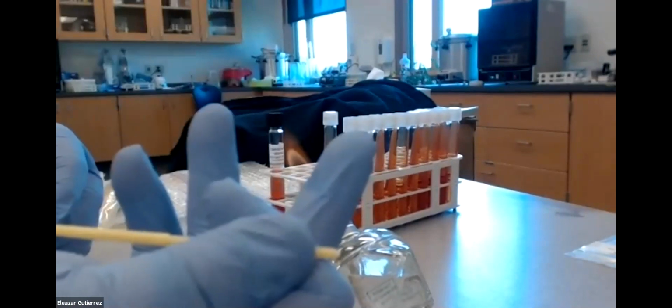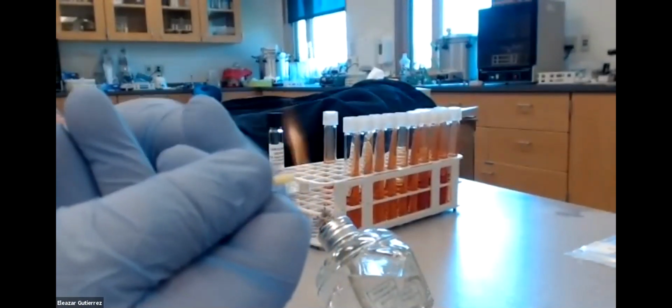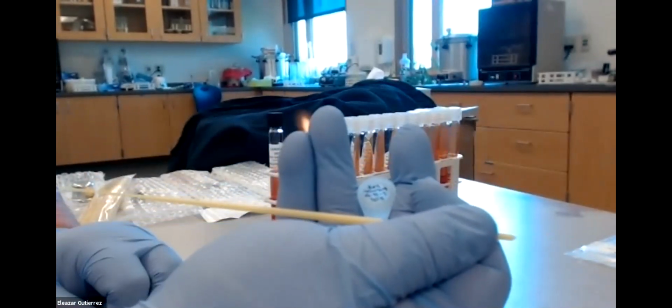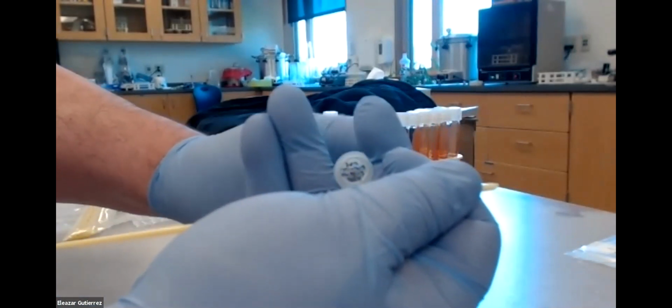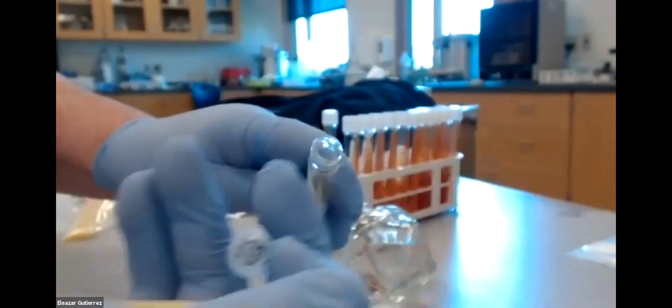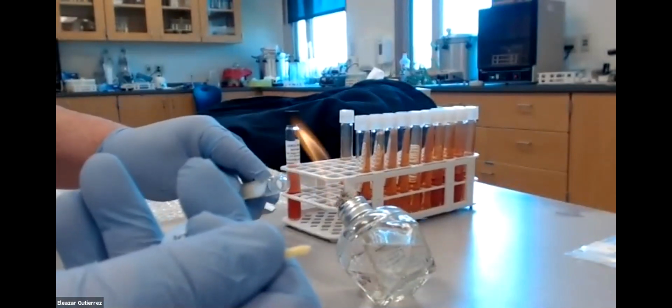So with the back of my hand, I'm going to grab the cap, just like so. You guys can't see that, can you? How about? There we go. Just like so. I'm going to push my lamp out of the way. Can you guys see that? Okay, the back of my hand, I'm going to unscrew my slant. There it is. And I'm going to pass it through my fire. 1, 2, 3 times. Okay.